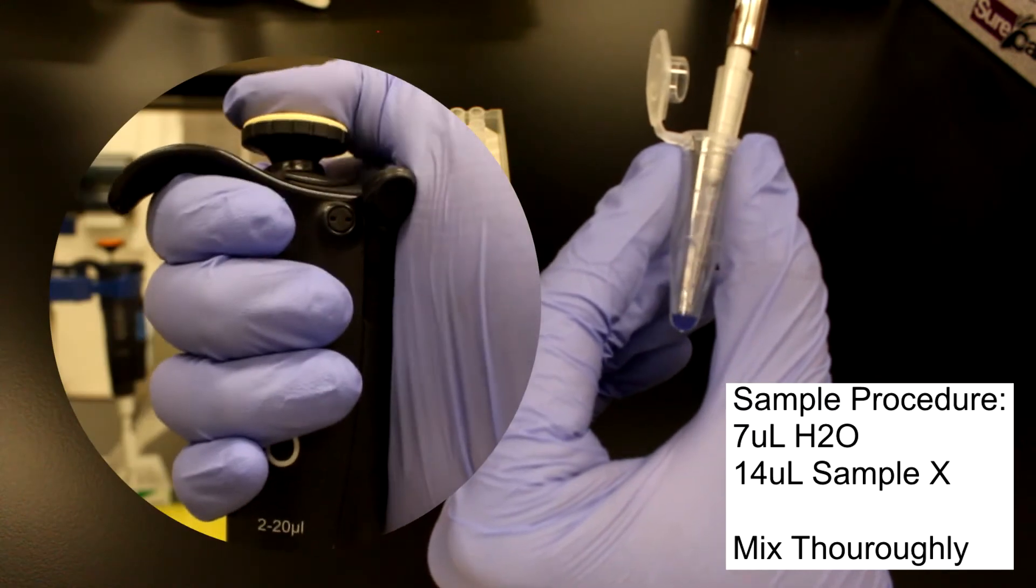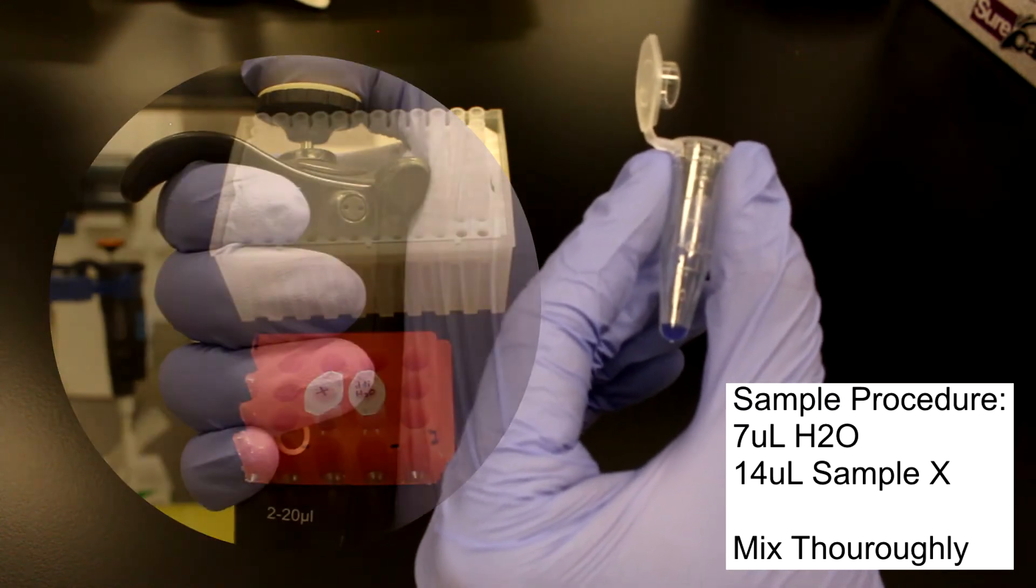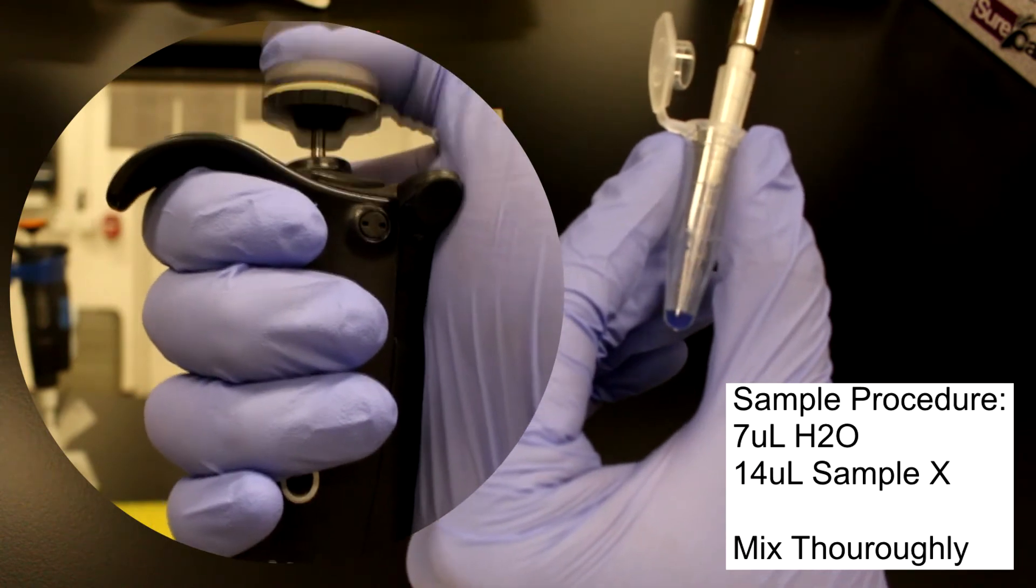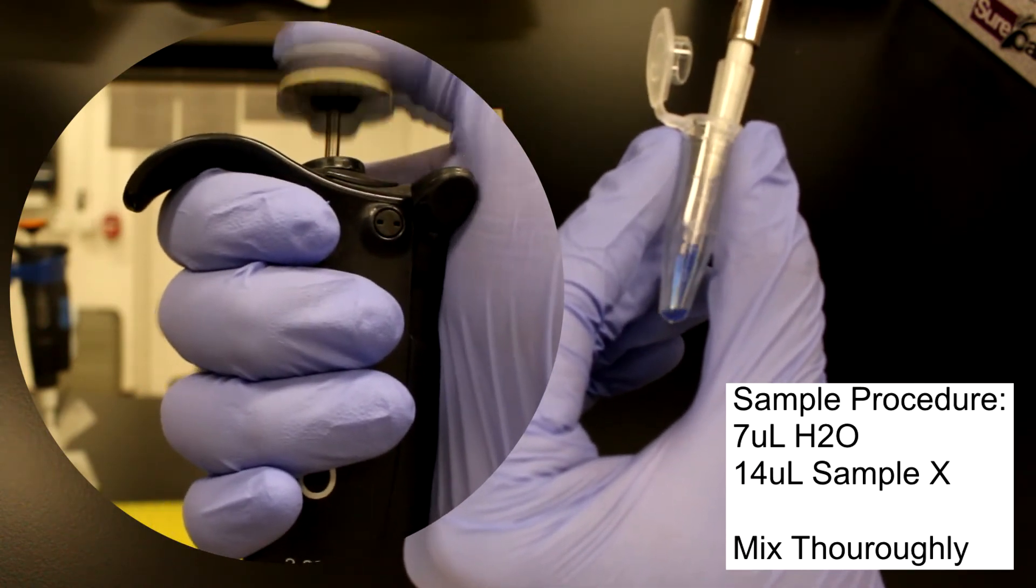To mix, the sample can be vortexed and centrifuged, or using the pipette by pipetting up and down, taking care to pipette only liquid as some samples may degrade if bubbles are introduced.